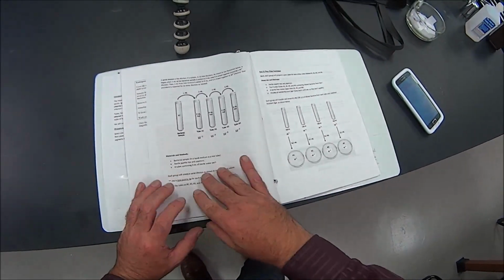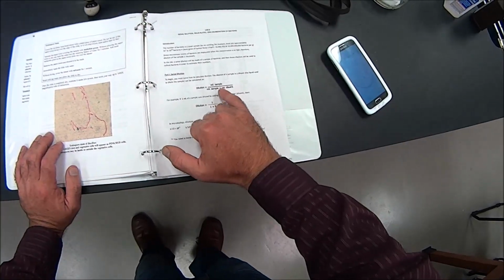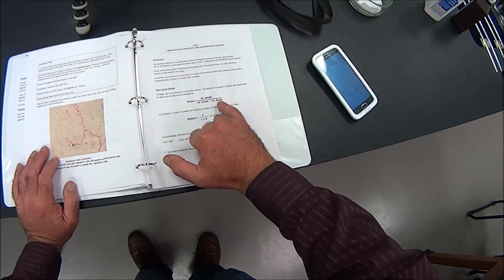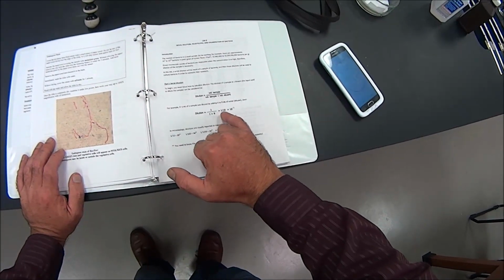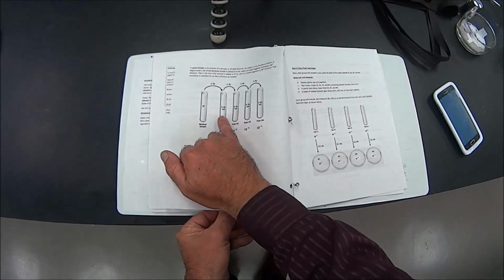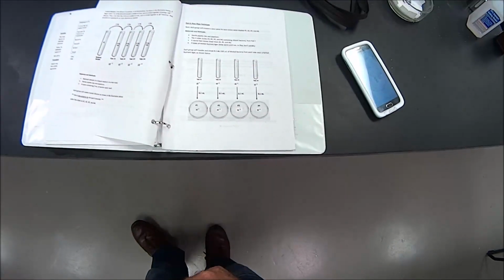How that calculation is done is right here on the first page. Take the volume of the sample, which would be 1, divided by the volume of the sample, which is 1, plus the volume of the diluent, what it goes into, and that's 9. So that'd be 1 over 1 plus 9 is 1 over 10, which is equal to 10 to the minus 1. So let's do these dilutions, and then we're going to put samples on petri plates to grow.